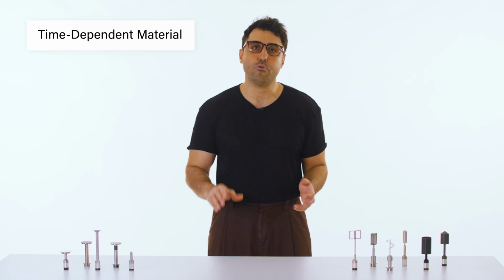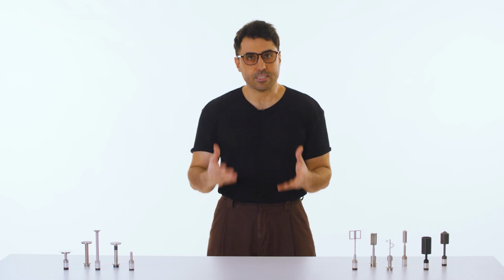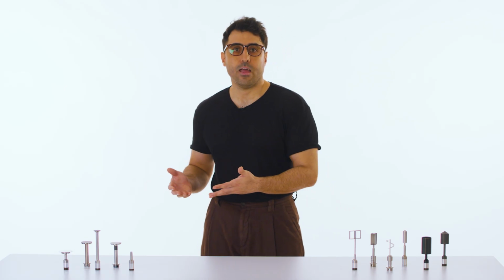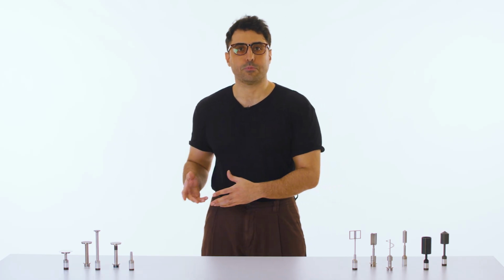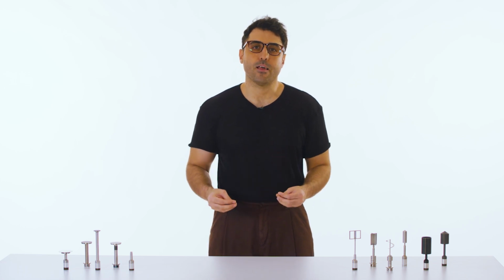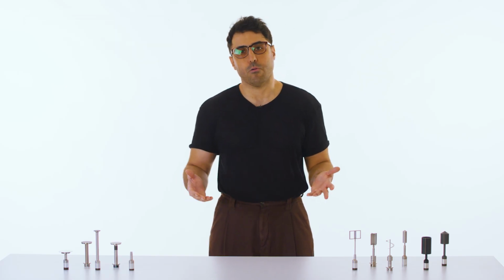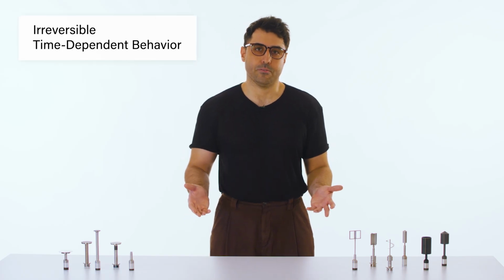And here's the important part. If the material's microstructure breaks down and becomes thinner over time under shear, then rebuilds itself and becomes thick again over time when the shear stops, and it does this reversibly, we call it Thixotropy. If the structure doesn't fully rebuild, or the change isn't reversible, then it is irreversible time-dependent behavior.